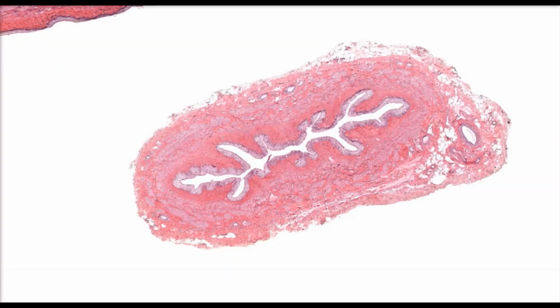Our last type of stratified epithelium is called transitional epithelium. Transitional epithelium is stratified, meaning it has multiple different cell layers. We call it transitional because we transition between many different cell shapes. Some of the cells in transitional epithelium will appear flat, some might be cube-shaped, some are rounded, some may even be columnar.